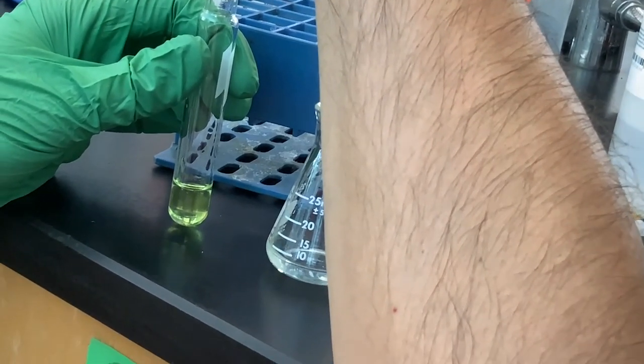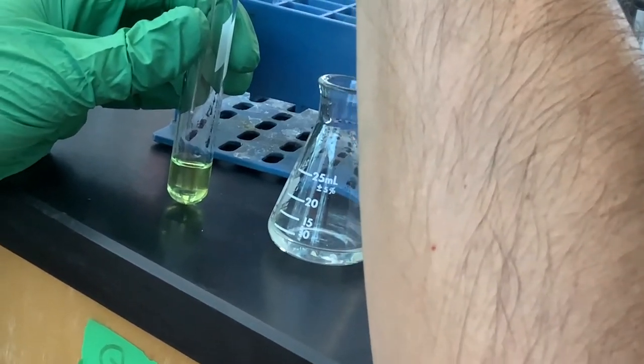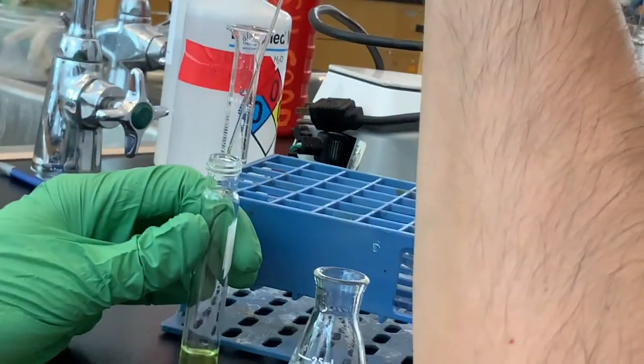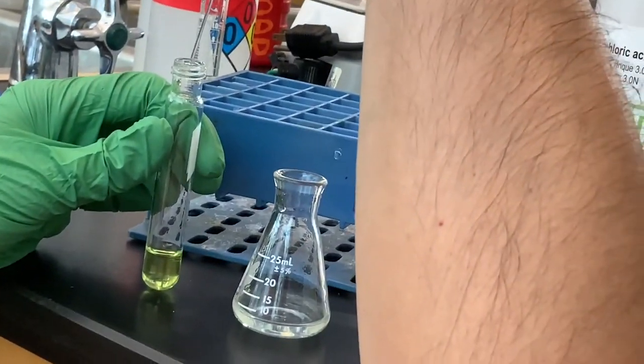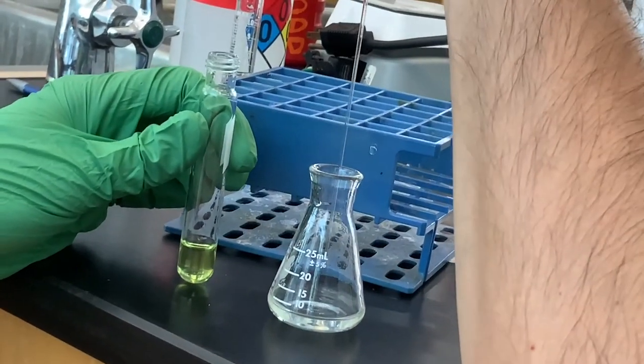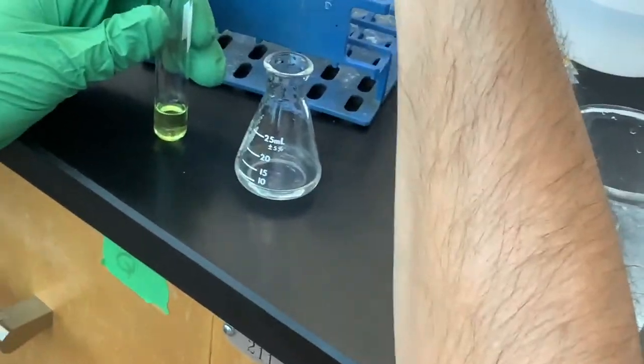And maybe once I get rid of that, you see that, that's really cool. Getting rid of any yellow that might be in the Pasteur pipette. And then that's the best I can do. Any residual water we're going to get rid of with a wash of just neutral water later, okay?